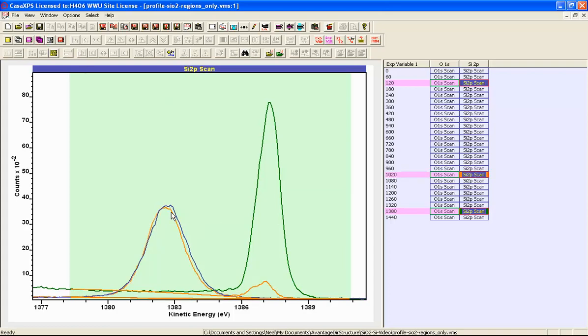So we have an oxide layer and an elemental signal, and these 2 peaks from a single spectrum, when fitted using appropriate synthetic components, will provide 2 pieces of information, whereas the oxide and the elemental spectra will provide the other 2 pieces of information that are required for the Hill equation.